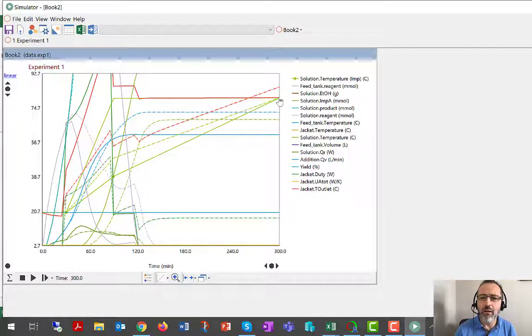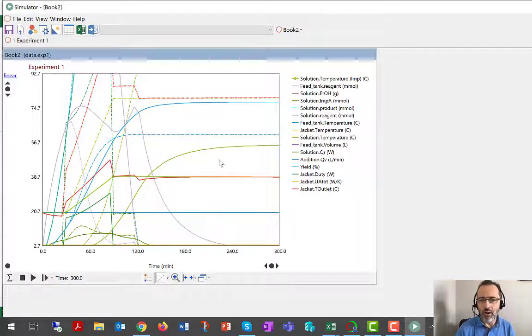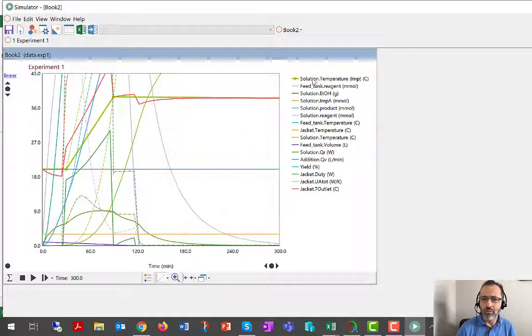I'm just going to try and carefully catch the points and take us down to a more moderate set of temperatures. So heating from 20 to 38 now. Again, I'm just doing this for power users so you can see the effect. And now when I run at this colder temperature, I'm back up to the 77, 78 in terms of yield percentage. Again, this model is calculating all of those kind of complex interactions, but now with that extra bit of control for me, the user, over the temperature profile during my reaction. And that's really imposed profiles, and one quite common way in which they can be used.